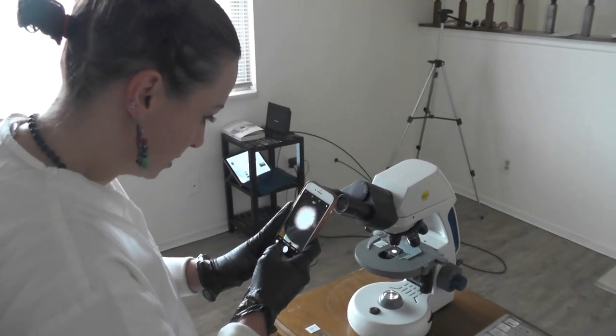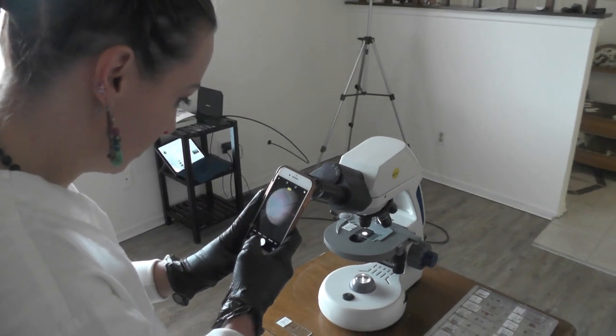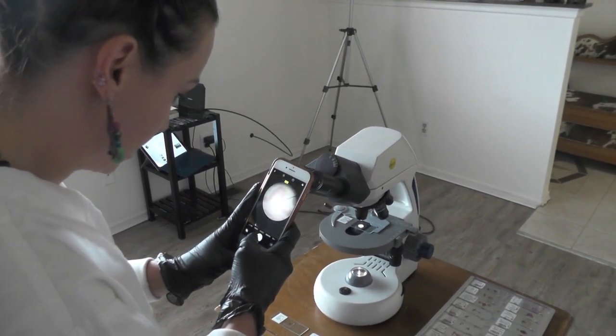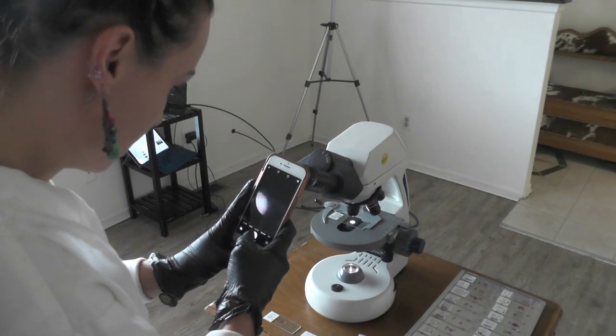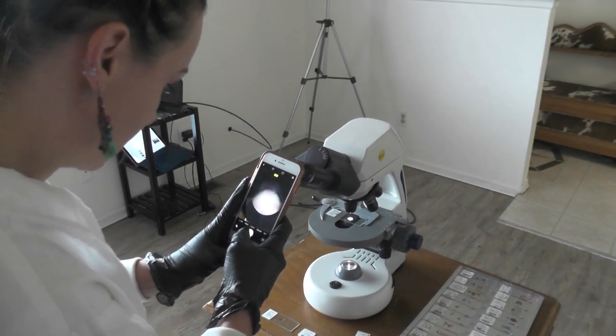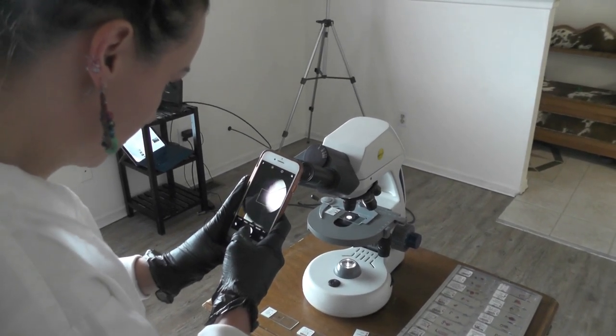And where this is folding, this is actually a beautiful section. We can see lamina propria and we can actually see the inner oblique layer of smooth muscle all from this one slide.